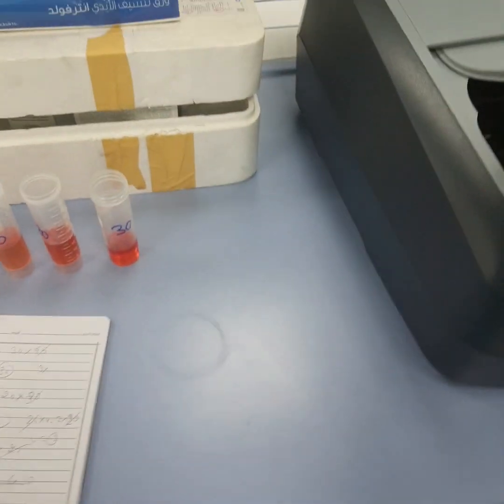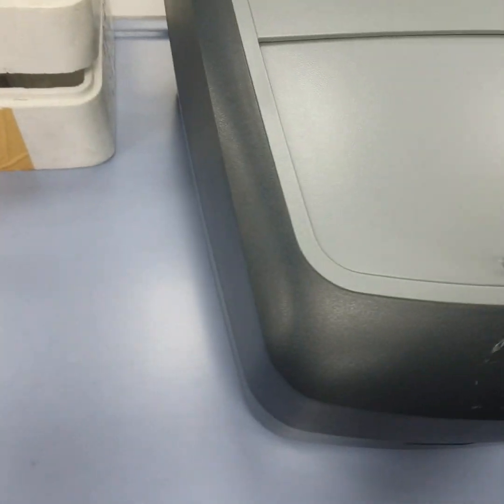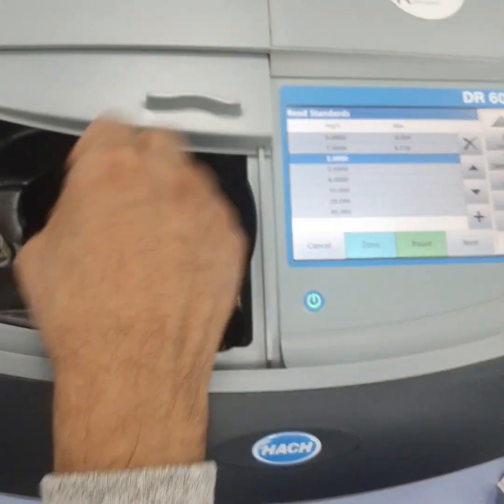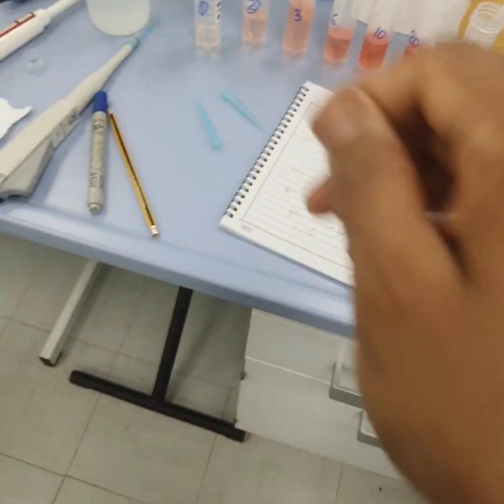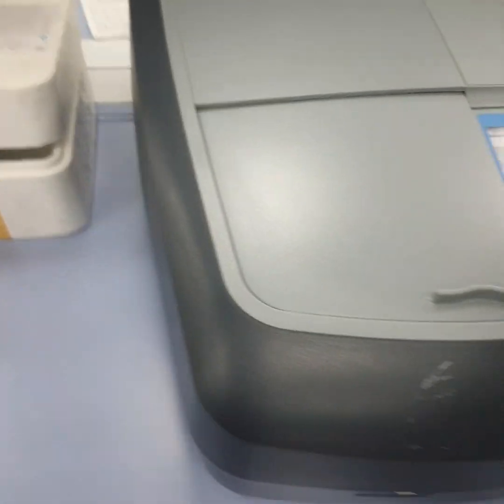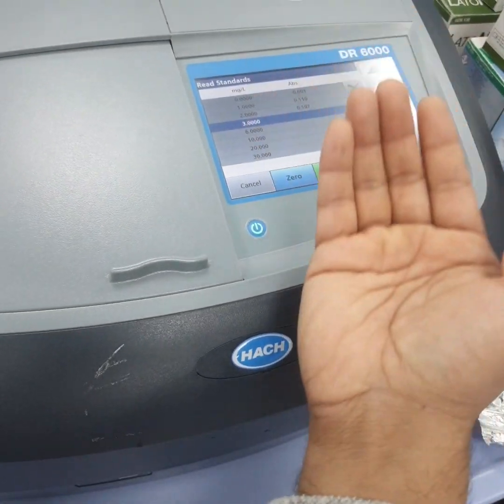Vial here, and then close, and then just read, not 0. Press read. So it is here how much? 0.11. Now discard this and add from the 2 ppm. This is 2 ppm, right? So now read. Ideally, if the 1 ppm shows 0.11, so 2 should show double. So it's almost double. Okay.